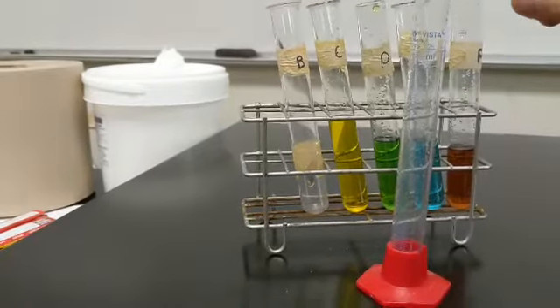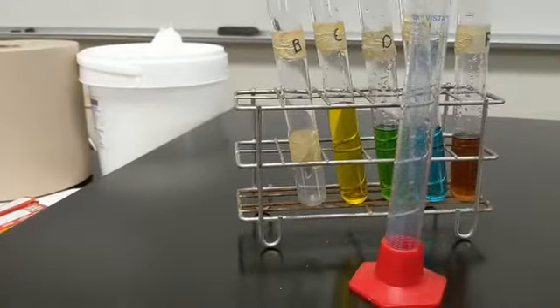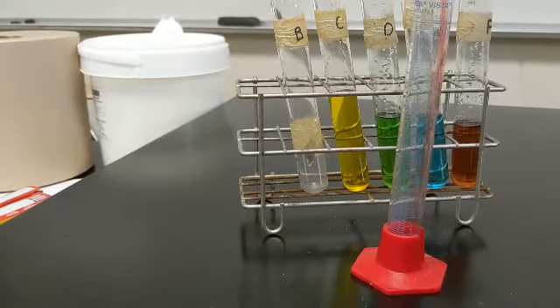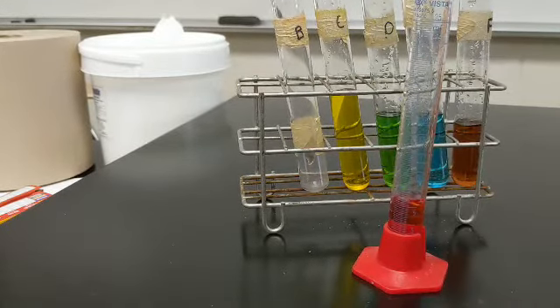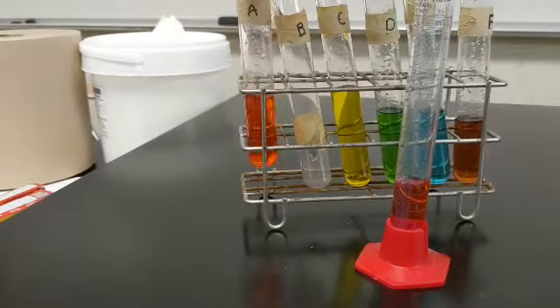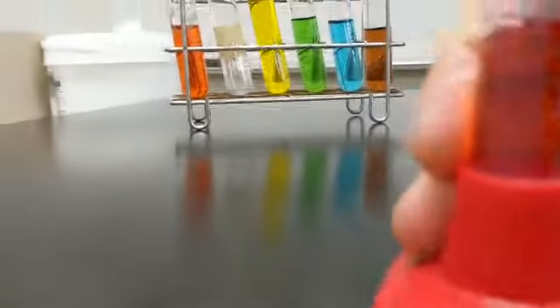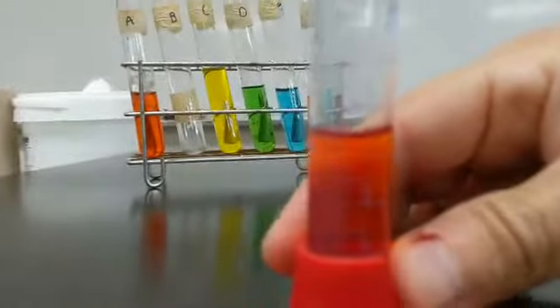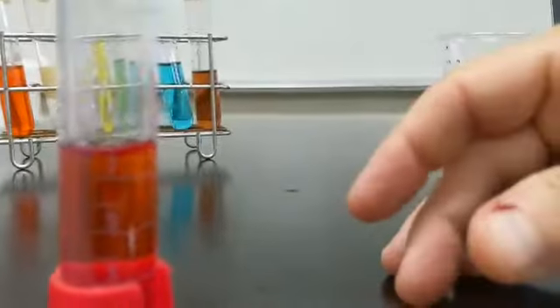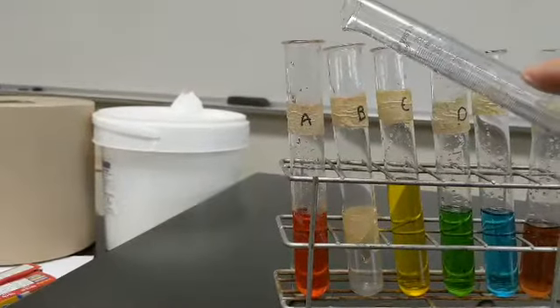Okay, so 8 milliliters to right about there. There we go. Well, it's not focusing, but it's there. And pour that into B.